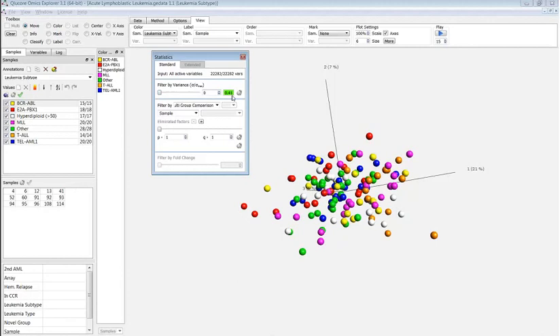I should also say that we have chosen to color the projection score box green for a very good score, yellow for a little bit less good score, and red for a bad projection score. The limits for these colors are based on our experience, mainly from microarray data, of what should be a good projection score.